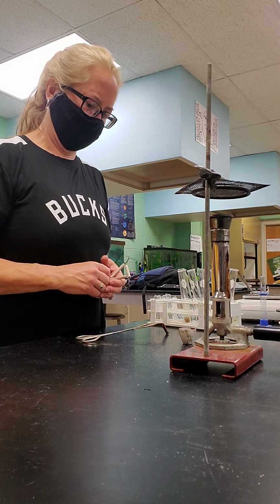Will, can you get me some just tap water, please? So now we're going to see if the products of this chemical reaction, because it gave off a gas, gave a color change, is this still sugar?